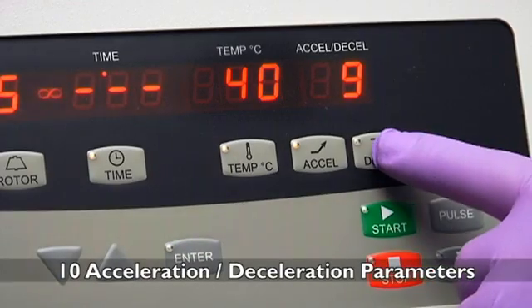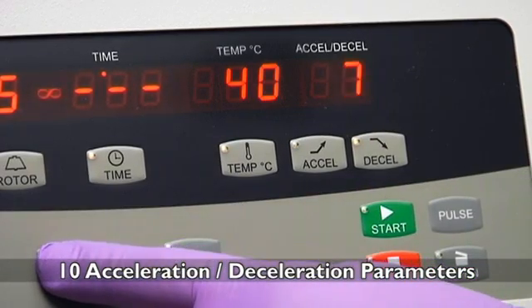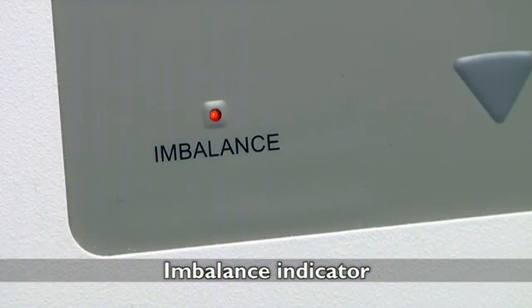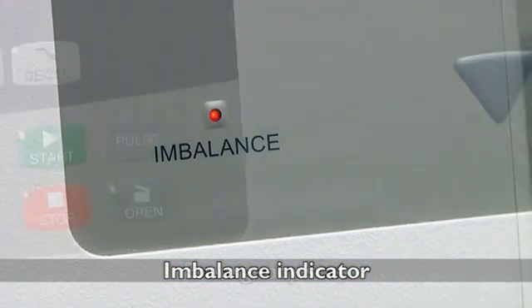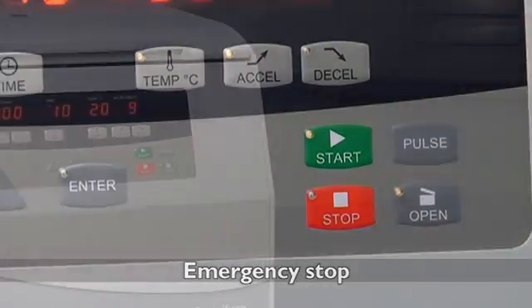Choose from 10 different acceleration or deceleration parameters that best suit your application. An imbalance indicator is easy to see and will alert you to protect sample integrity. Press and hold the stop button for 2 seconds to halt the machine in case of an emergency.